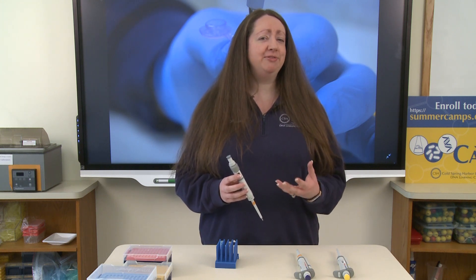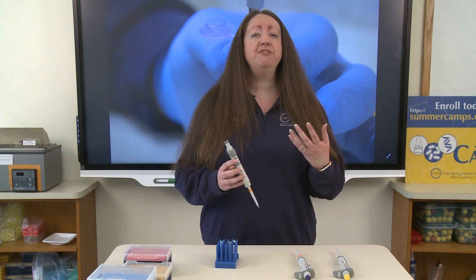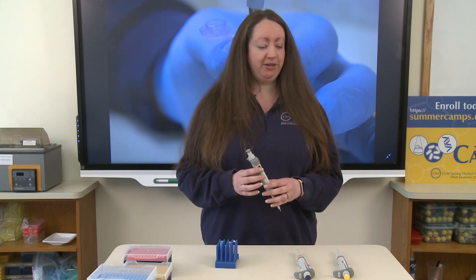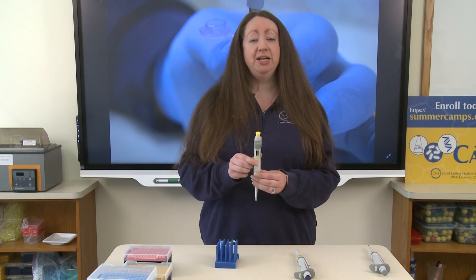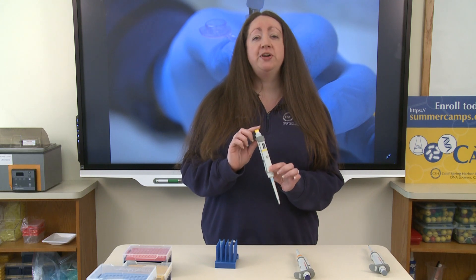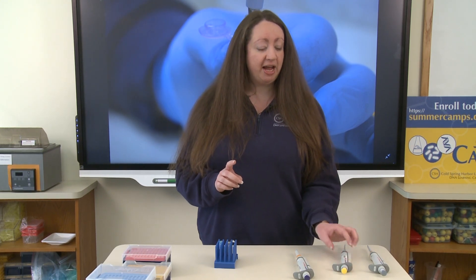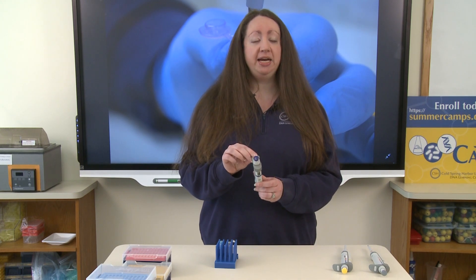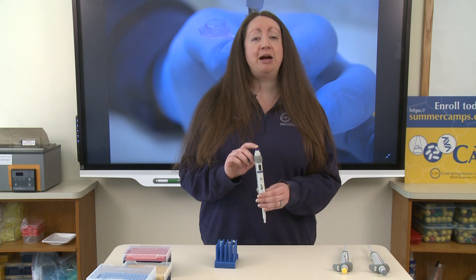To give you an idea of how much liquid that is, a melted snowflake is just a few microliters in volume. The next micropipette we use has the yellow cap, and it measures a volume from 10 microliters up to 100 microliters. Finally, this blue micropipette measures a volume of liquid from 100 microliters to 1000 microliters.